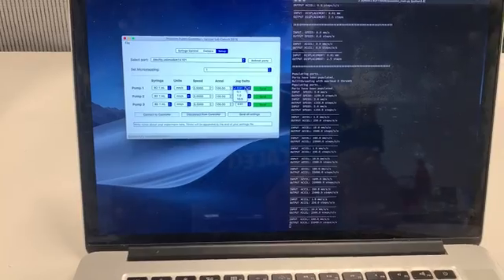Another way to run the syringes is to change the displacement amount for each one individually. For example, I want to move pump one forward 10 millimeters, pump two backwards 10 millimeters, and pump three forward 8 millimeters. Note that I put a minus sign to indicate aspiration — moving the syringe plunger backwards. Once all three values are set, I simply click Run.